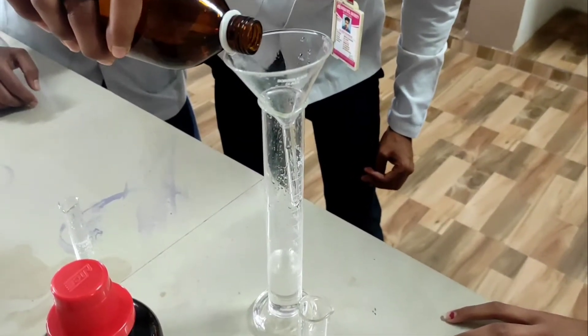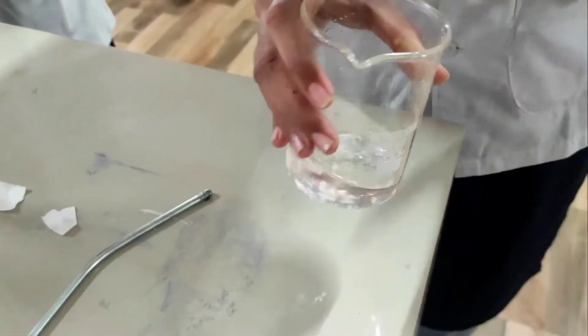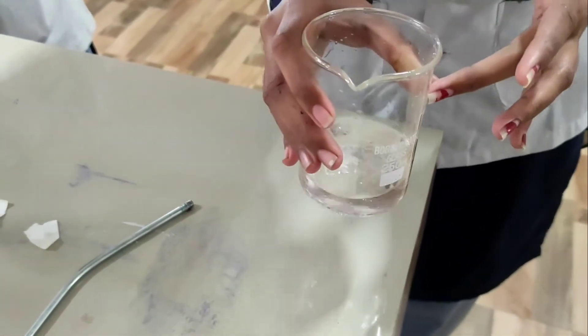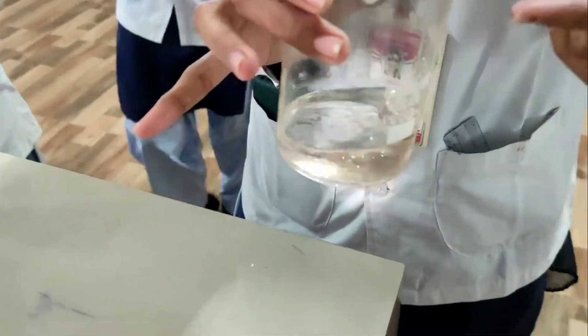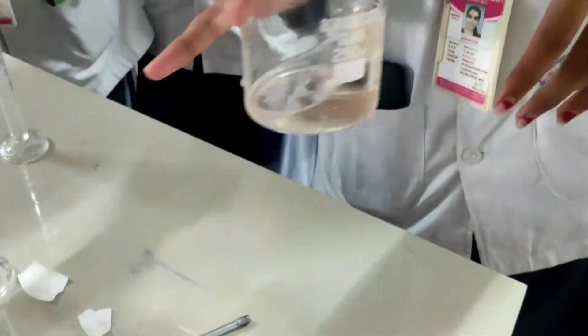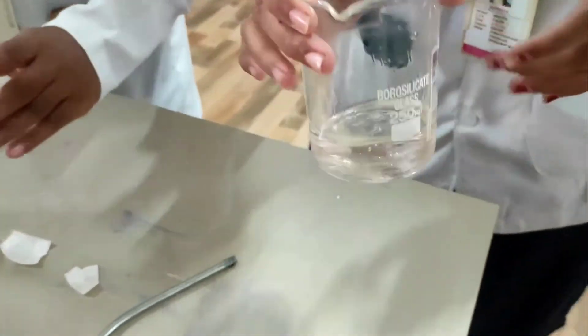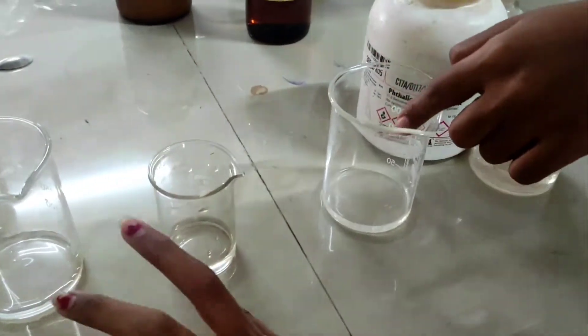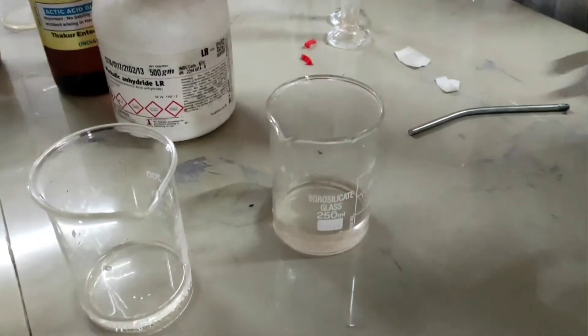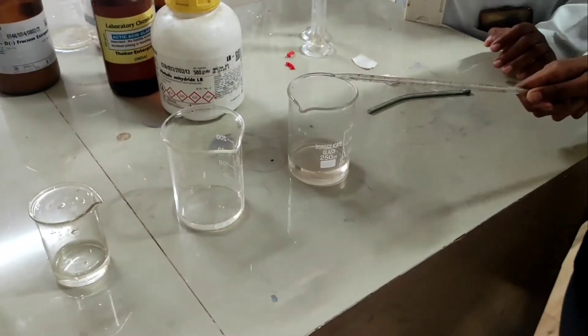The next step is to cut Whatman paper to a rectangular size, place a mark and draw a straight line about one centimeter from the bottom, and mark three spots on that line where you're going to put your samples. Your samples include three: one standard glucose, second standard is lactose, and the third is a mixture of both glucose and lactose. You have to identify and compare the RF value of the sample with the standard ones.